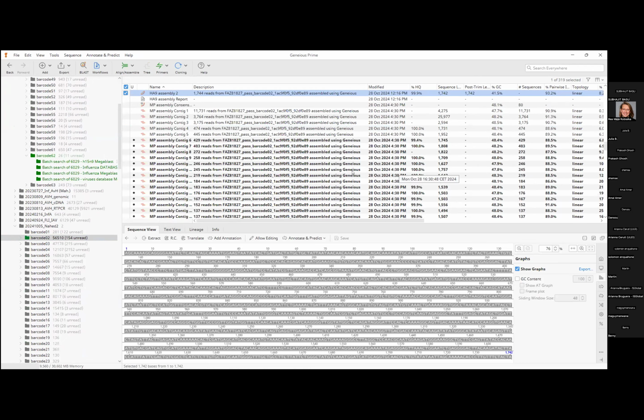that Prakash mentioned before. So basically, the de novo assembly tool looks for overlaps between your sequences and recreates a longer sequence, a longer contig. And in doing so, it will get you in the end the full genome. Yeah. So you go from reads to contigs to scaffolds to the full genome. That's, let's say, the different steps going towards your full assembly.